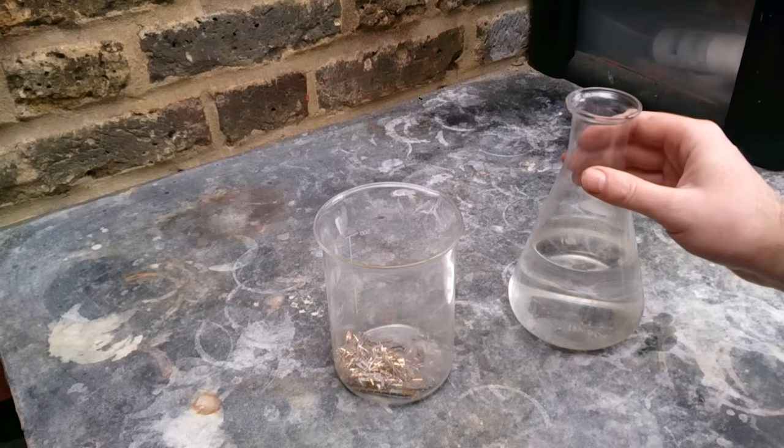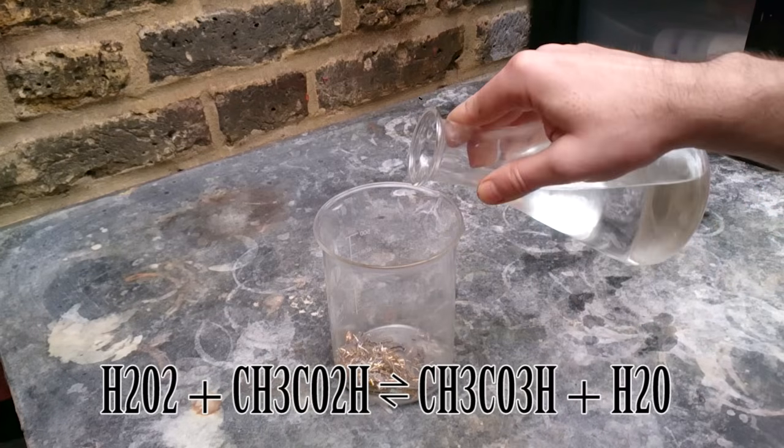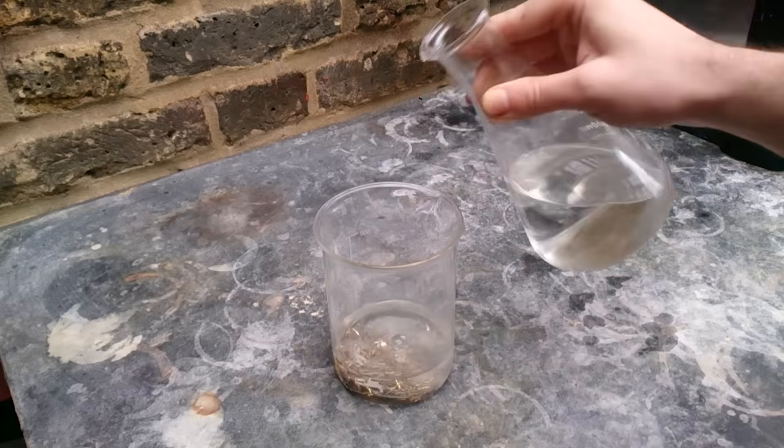Here we have about 12% peracetic acid solution. Do not add everything at once — do it in small portions. Also, do not add anything else to your solution at this point; I will cover that in more detail a bit later.